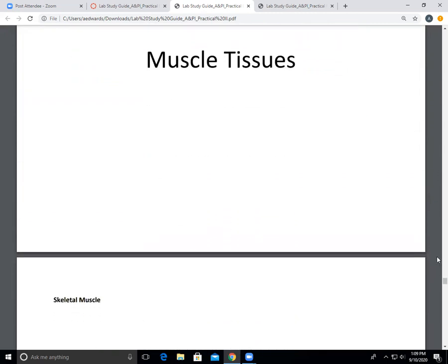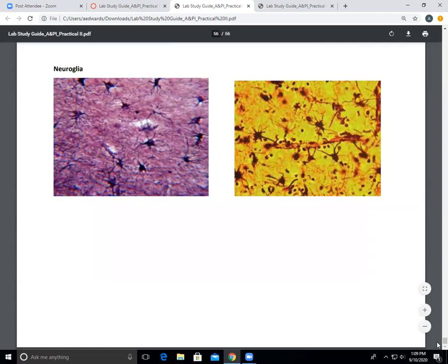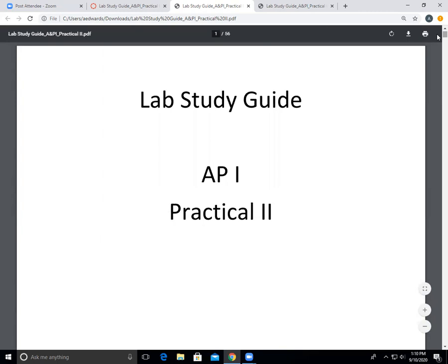I think I will skip ahead just a bit past the tissues. So we'll pause there on the video. What we're going to do in class is look over the slides that we have at our tables. We're going to get them focused, and then you can go around and take pictures of every slide, and we'll match the slide with the white piece of paper.